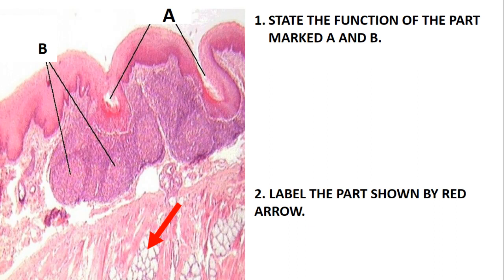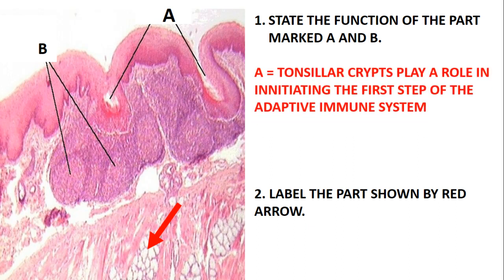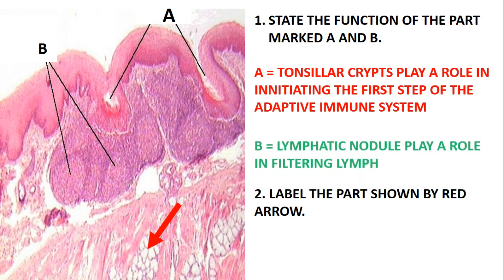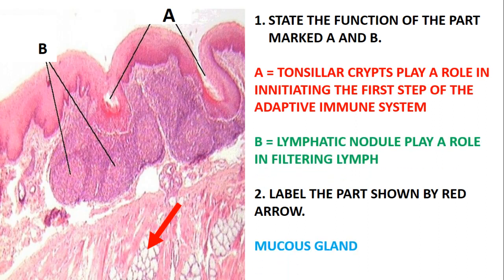State the function of the parts marked A and B. This slide could be the tonsil. Part A is just the tonsillar crypts, which play a role in initiating the first step of the adaptive immune system. We need to understand that we have the innate immune system and the adaptive immune system. Part B is the lymphatic nodules, which play a role in filtering lymph.